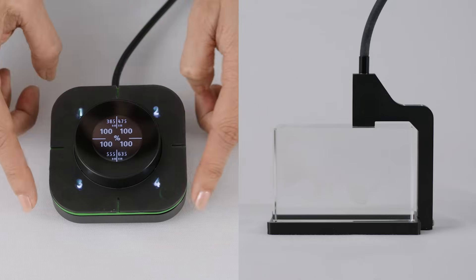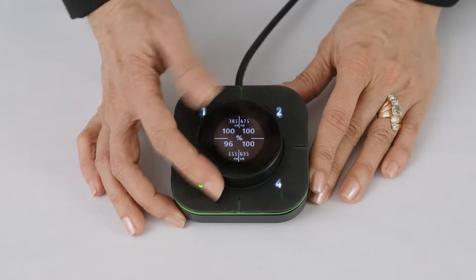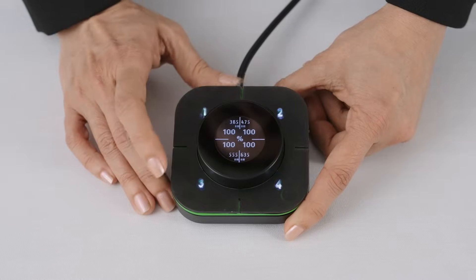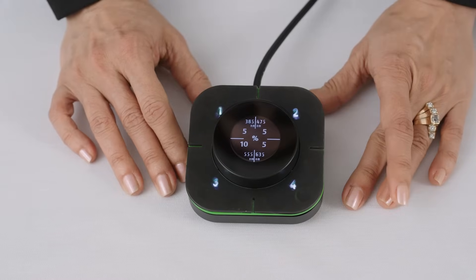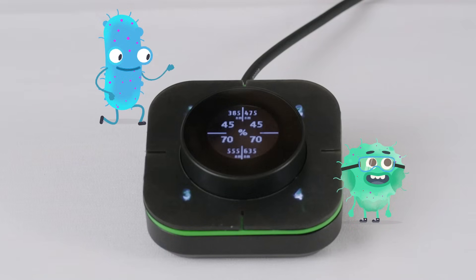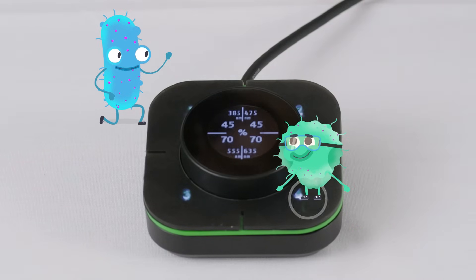These four buttons allow you to turn each channel on and off. Intensity can be adjusted with the center dial. LEDs can be turned on individually or in combinations. To turn on all four channels simultaneously, simply press the center dial. The smart dial can save four user profiles, defining favored intensity settings for each channel. Profiles can be created for samples being imaged repeatedly that have specific illumination requirements.